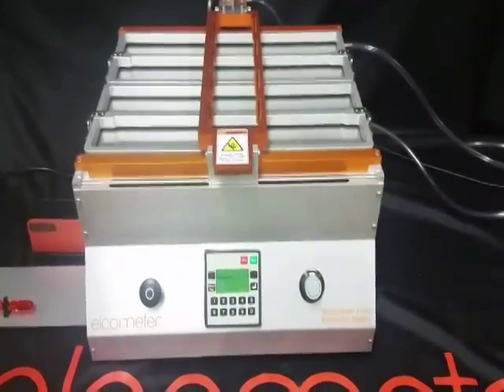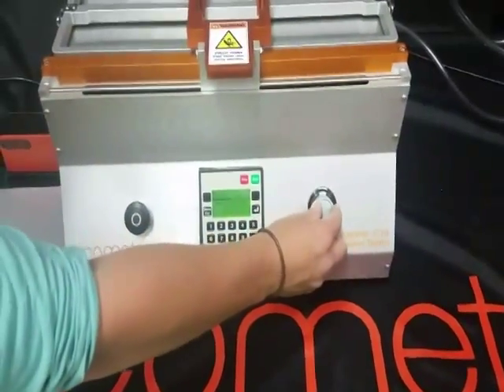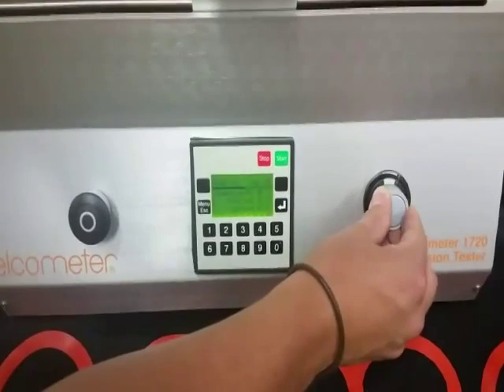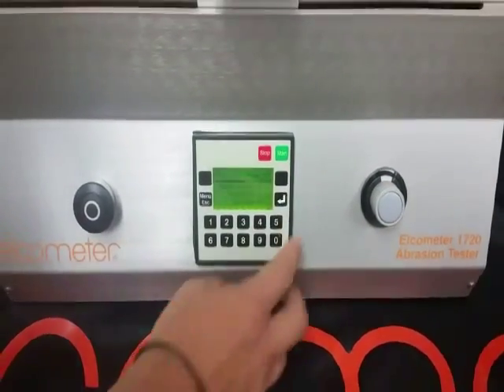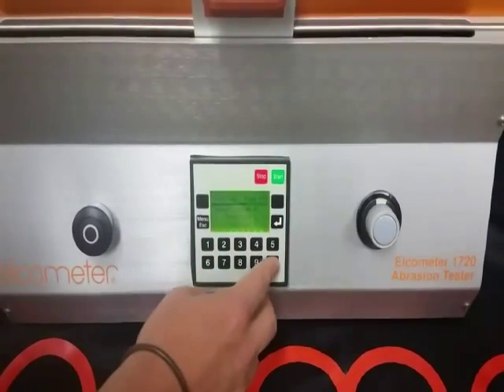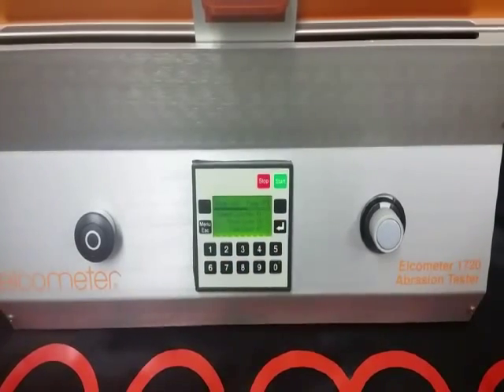With the machine, you can adjust your speed cycles from anywhere from 10 to 65 cycles per minute, and your preset cycle count from 1 to 32,760. For this demonstration, we will set the count to 10.